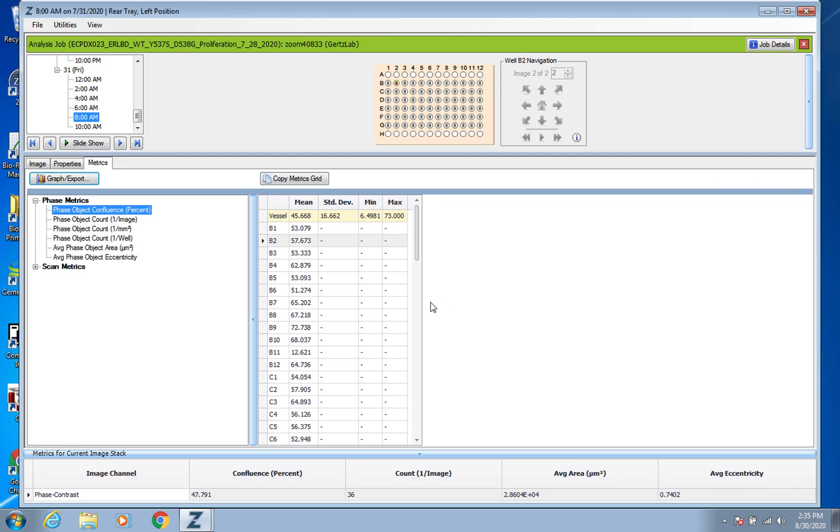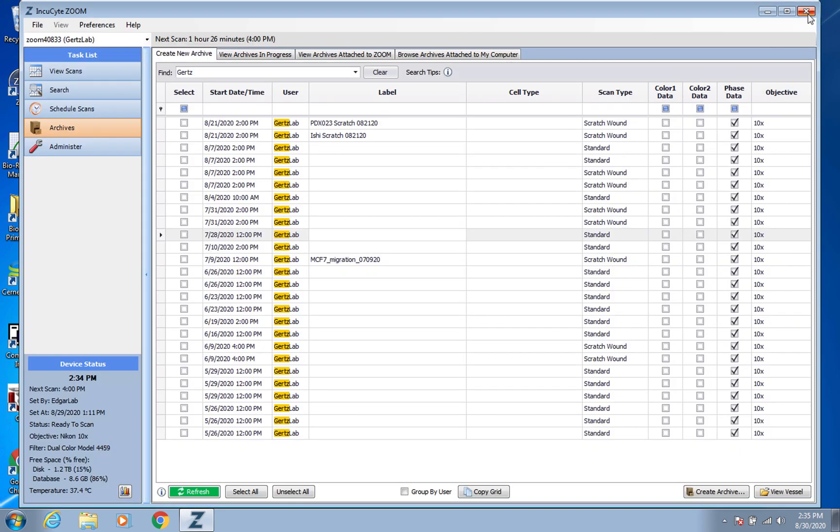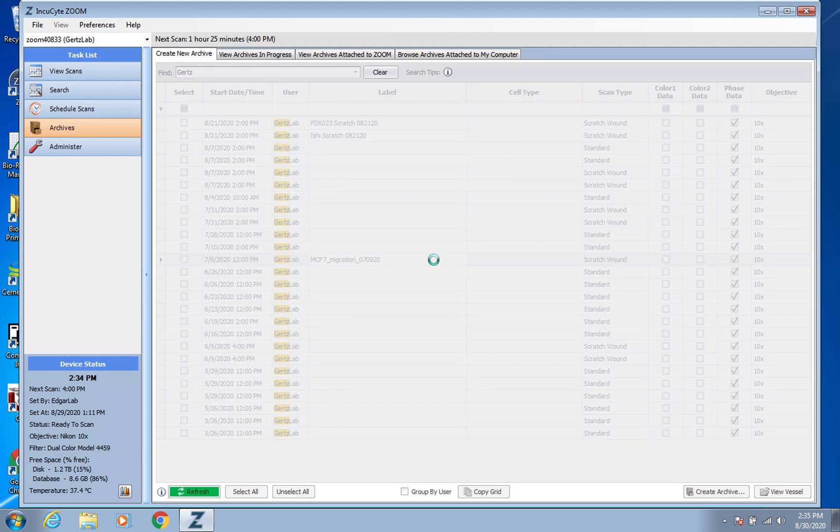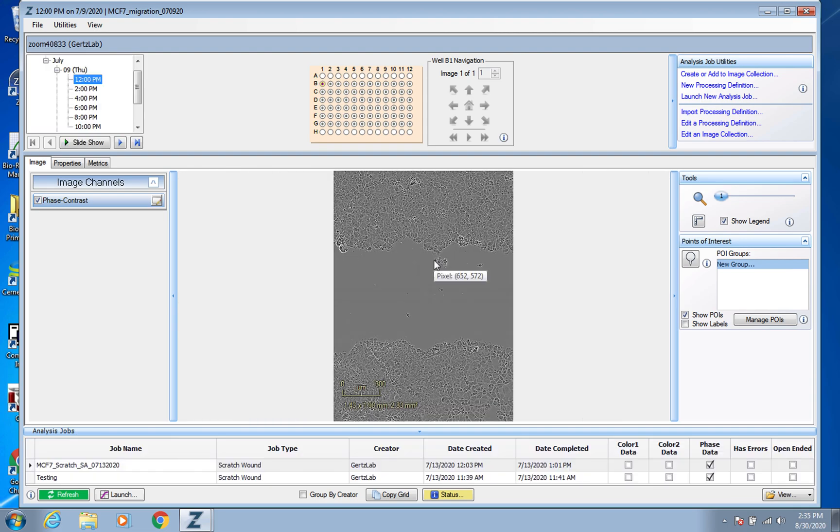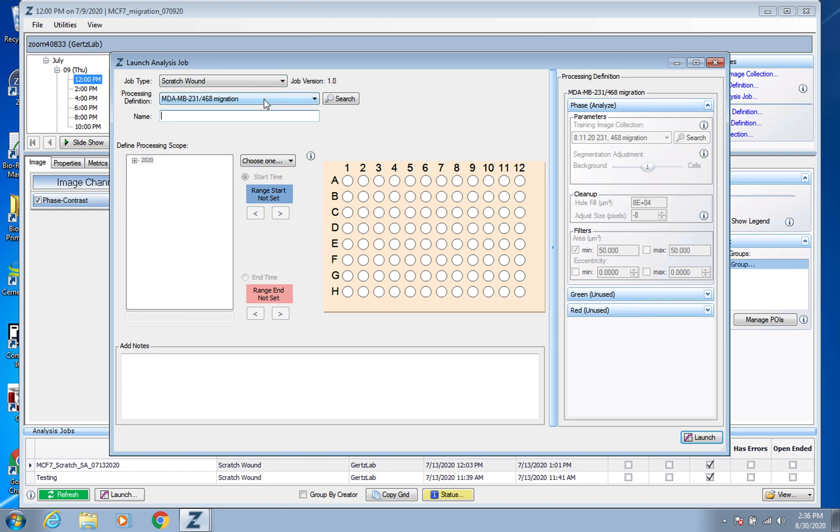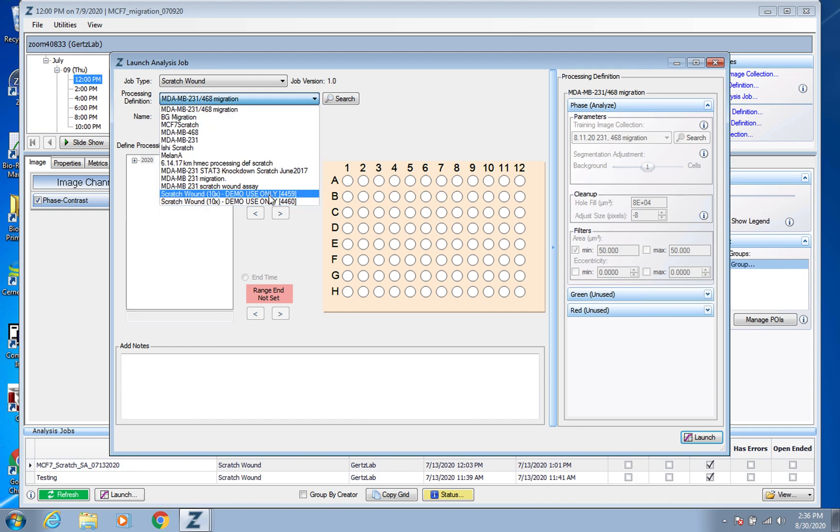So that is for a proliferation plate. And then as far as for a migration plate, so here is an example of a migration plate. It's a pretty similar process. Again you're back into this page. If you need to run the analysis job because it hasn't been run yet, again go up to this top right Launch New Analysis Job.